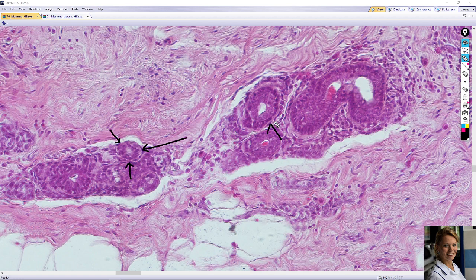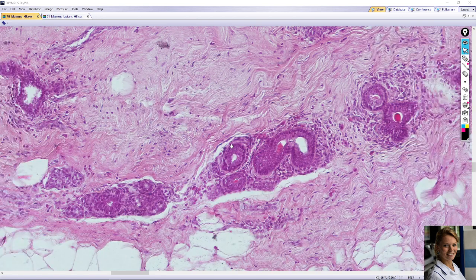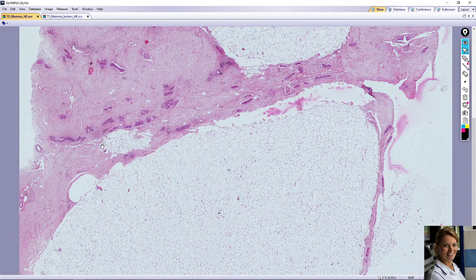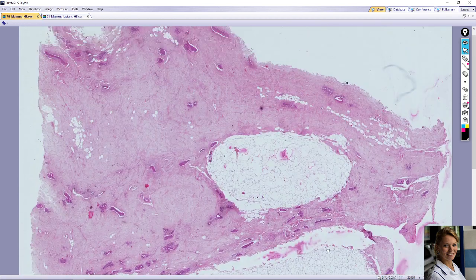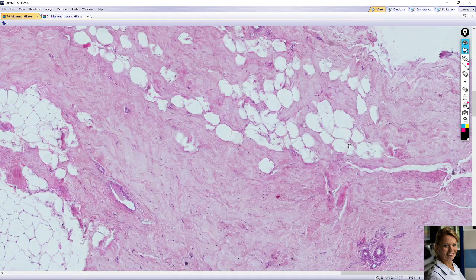The intralobular ducts are surrounded by a loose intralobular connective tissue, for example here — a loose intralobular connective tissue. Mammary glands also contain a lot of adipose tissue, for example here, a big space of adipose tissue here and here, so here you can see fat cells.